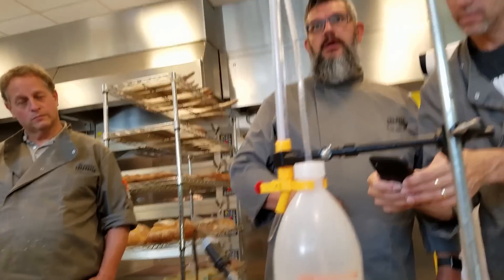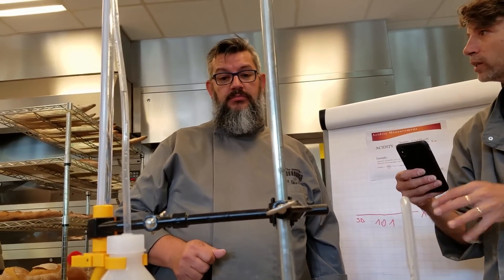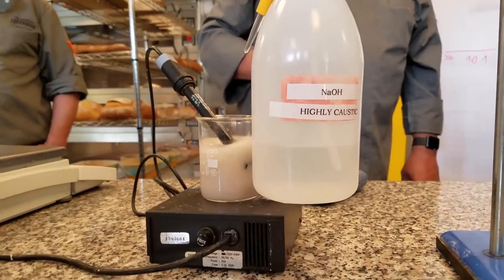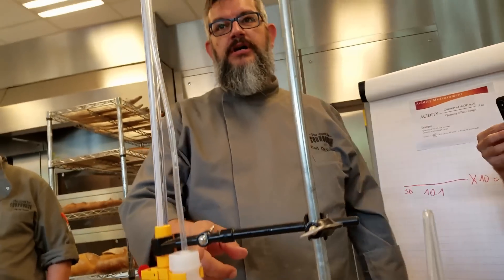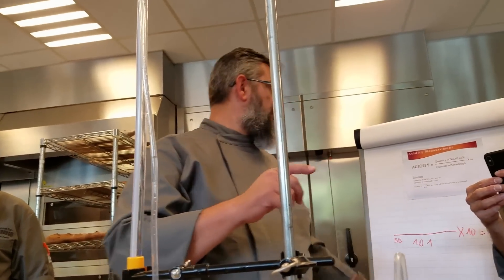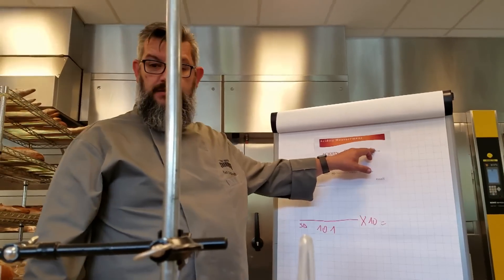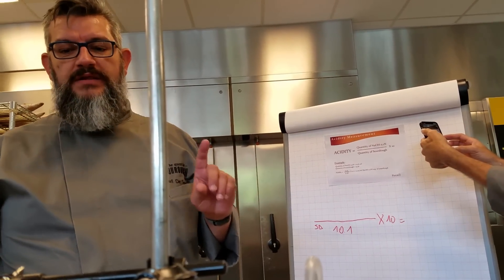So you cannot do this without this equipment? No, this you can do so far, what we did. I think if you have the right equipment, you can do it. Now I will start adding the sodium hydroxide. So it's a dilution of what they call one mole.